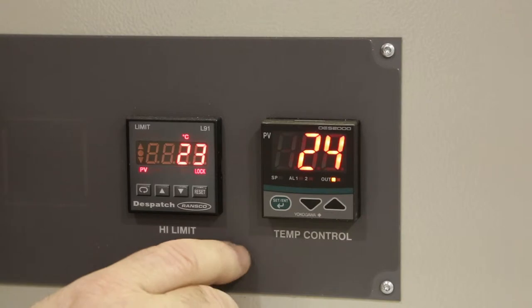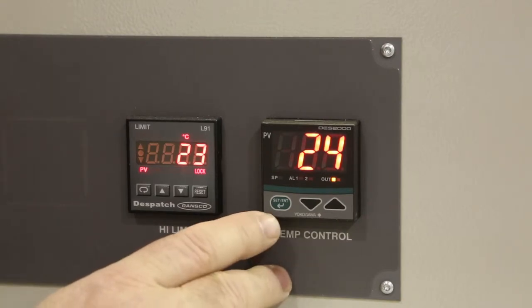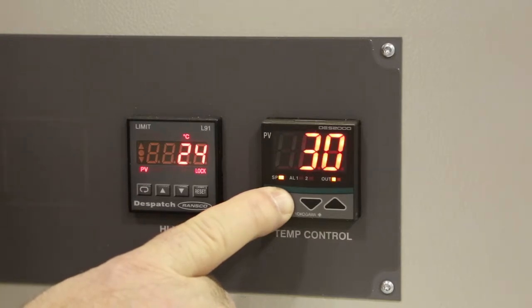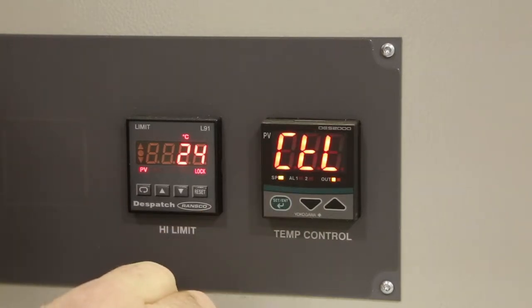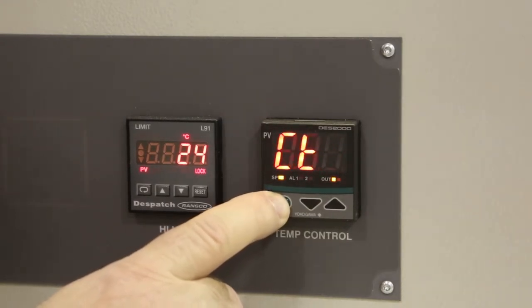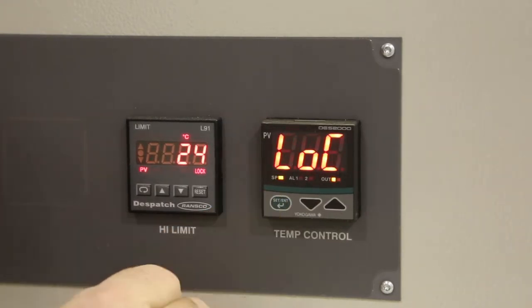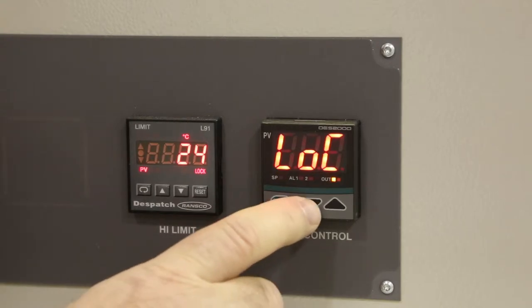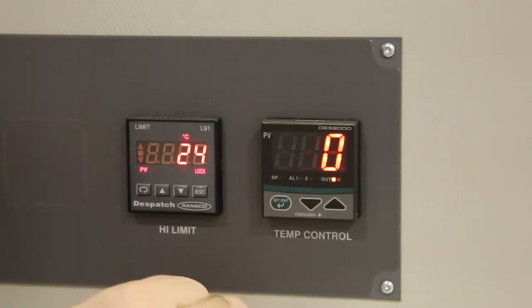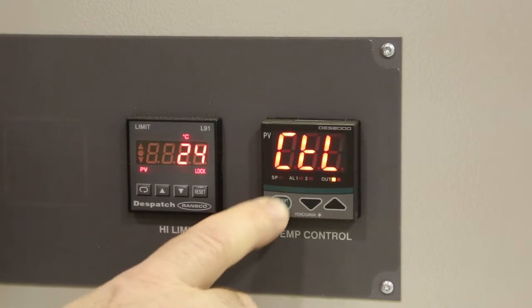The first thing we must do is access the configuration menu. Press and hold the green button until CTL for control mode is displayed. Cycle the green button until LOC is displayed. Change that value to 0 using the down arrow and then press the green button to set the value. Press the green button until you return to CTL control mode.